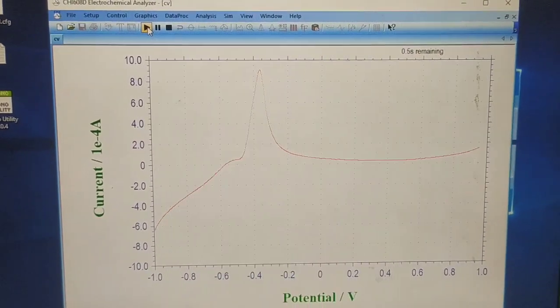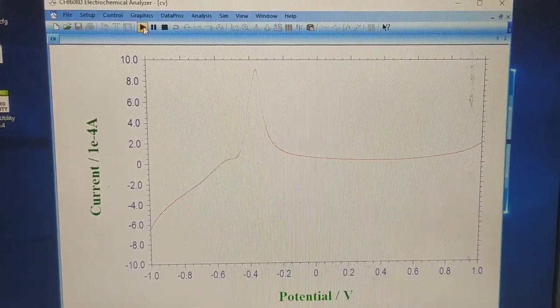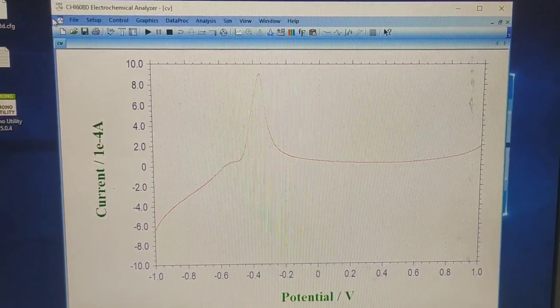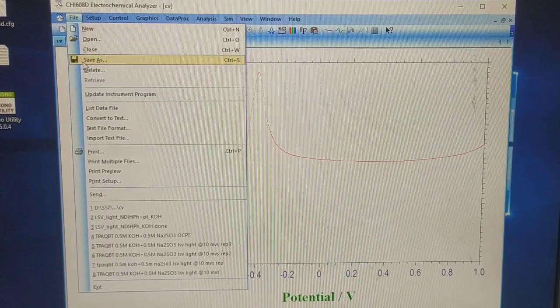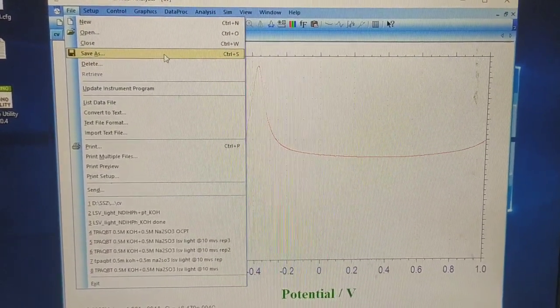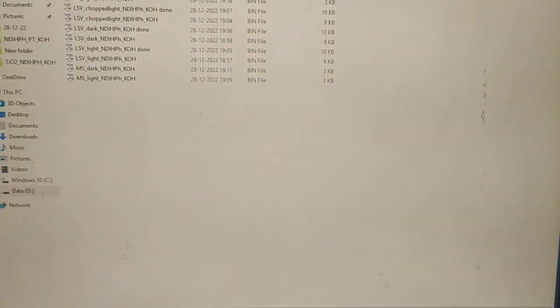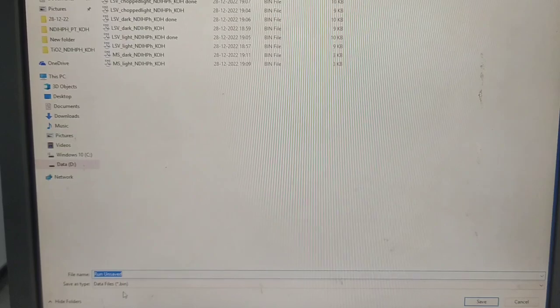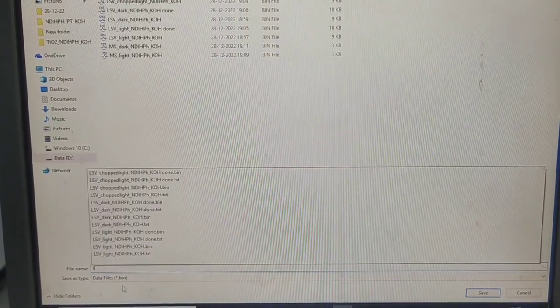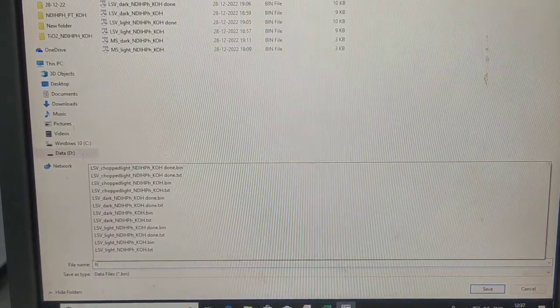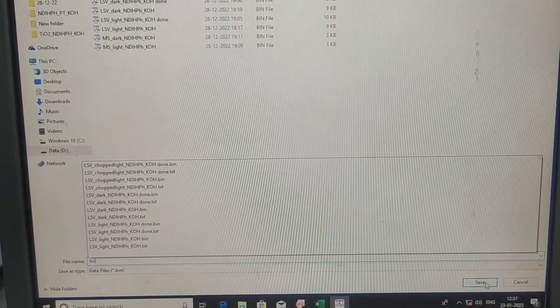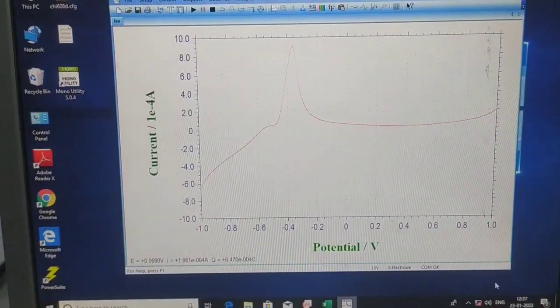This is the LSV graph. Now let us save this graph also — go to file, save as, and we will give it the name LSV. Okay, and then save.